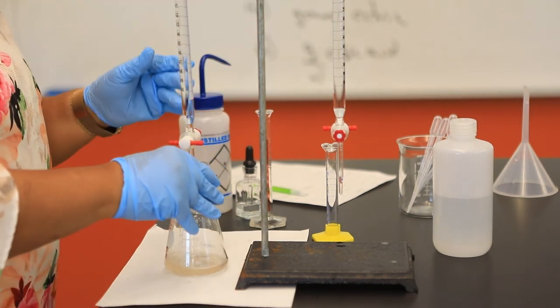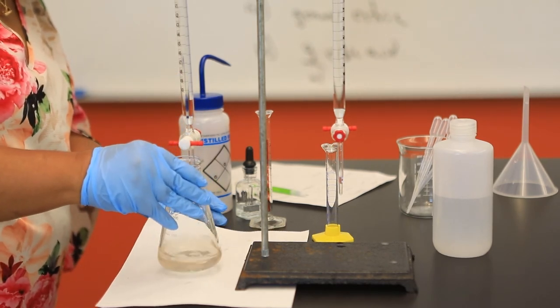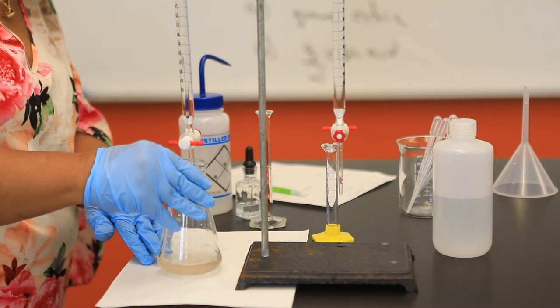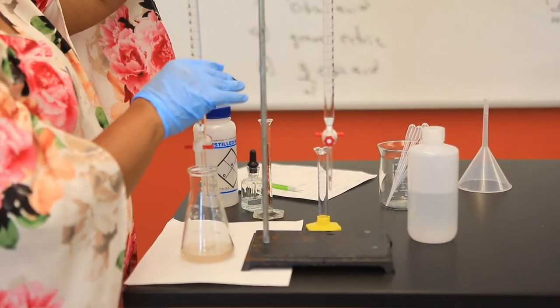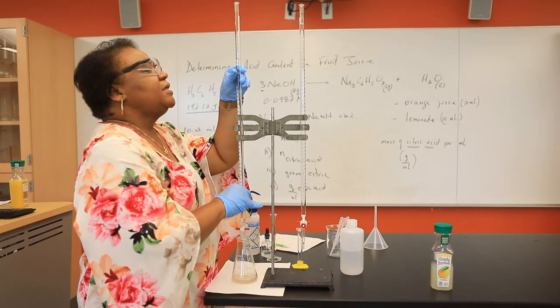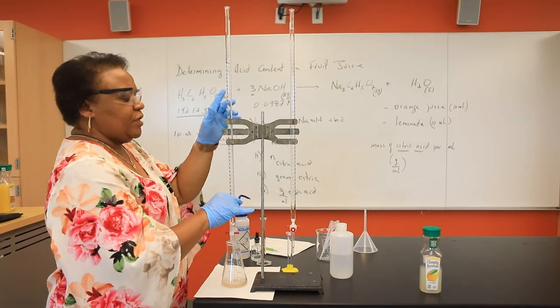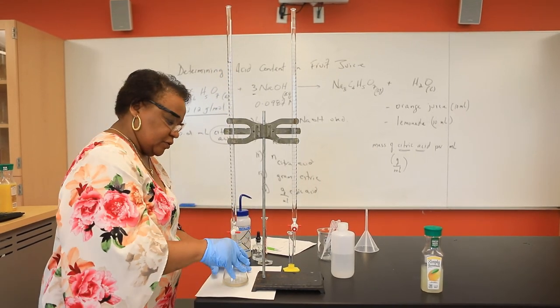Now the titration is complete, you'll notice that the solution - there is a color change. It's obviously faint pink in color, and the final volume is 9.80 mLs. So the final burette reading is 9.80 mLs.